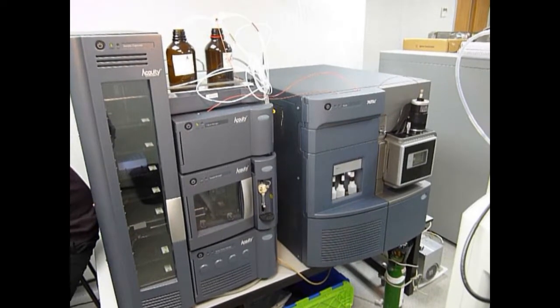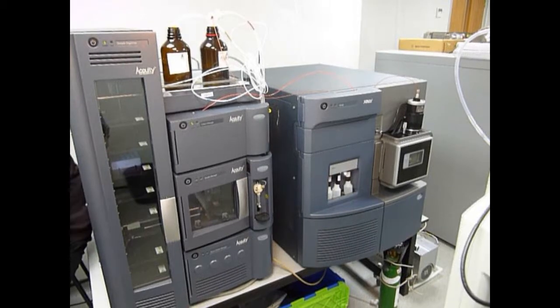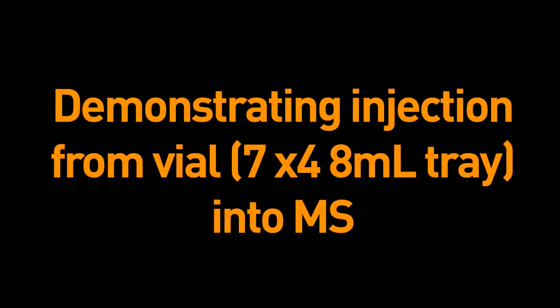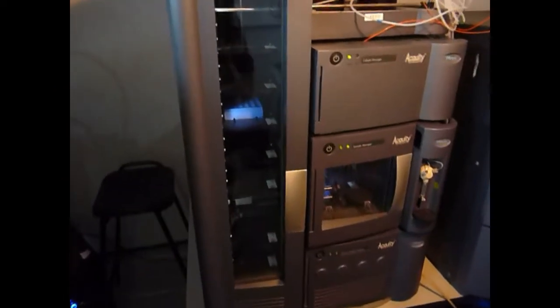It's a fully integrated system that uses MassLink software — a very user-friendly MassLink software. I'm just going to demonstrate here the injection. It's just one vial from level 7 on the system that's taken the sample. There are 2 ml vials and 48 ml trays, and then it goes into the sample manager, carries out the injection, and injects the sample.